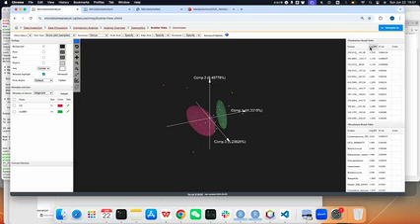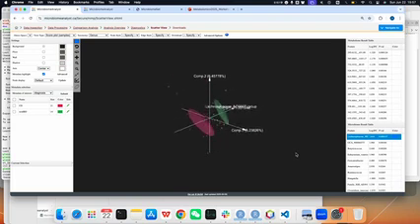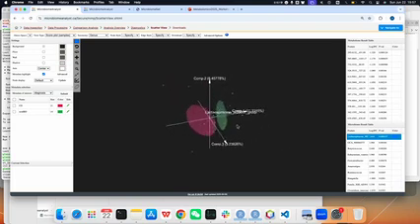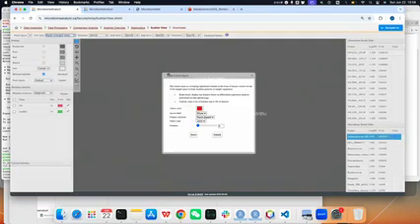The different thing is we have the result table here on the right side, and when you click, you can see the biplot, for example here, and you can see the dominant features that drive the component. Maybe we can change to a biplot view.